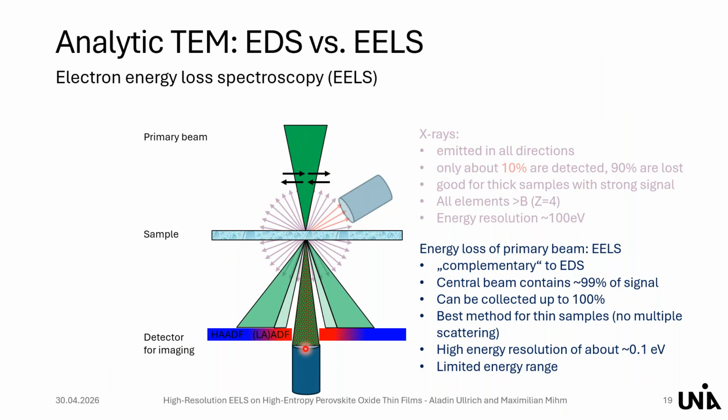and therefore we expect all of the signal to be collected in the spectrometer, because a typical angle under which an electron is scattered, a 200 keV electron that has lost something like 1000 eV, what's expected for the rare earth metals approximately, is scattered under an angle of about 10 milliradians. And so with these 74, we are absolutely sure that we collect all of them and don't lose signal.